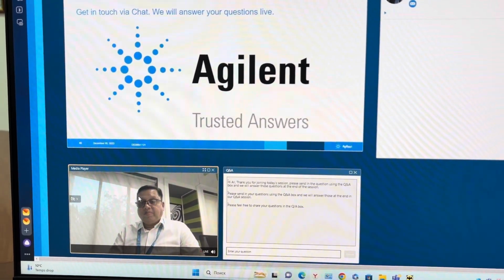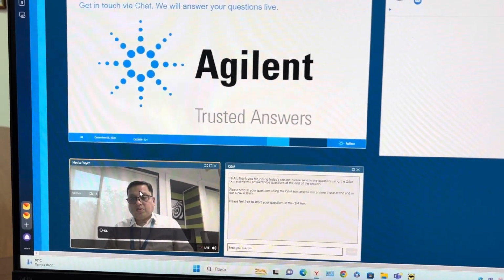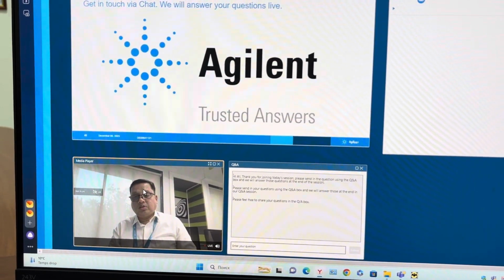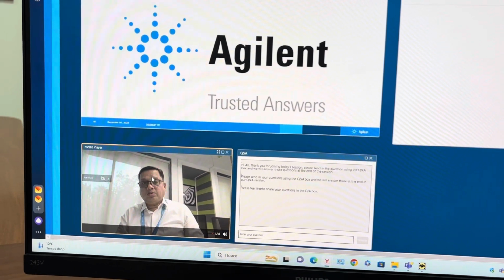Okay, thank you, Sunil. Thank you so much. Another question is, what is the recommendation? There are two types of solvent filters, the glass solvent filters and the stainless steel solvent filters. So which one do you recommend using?